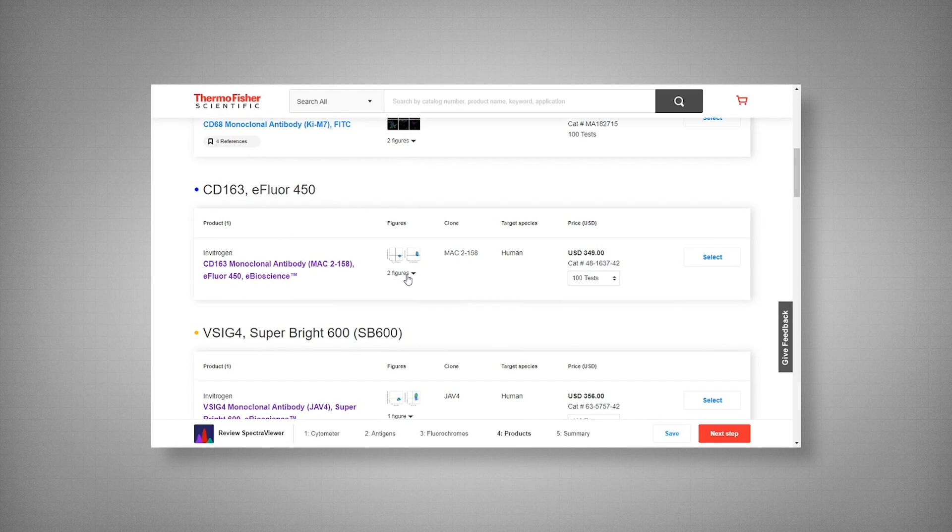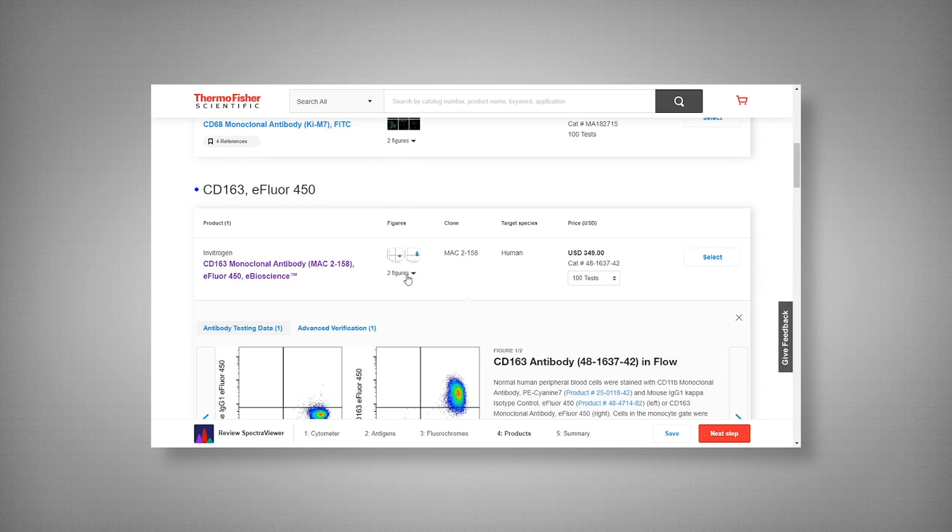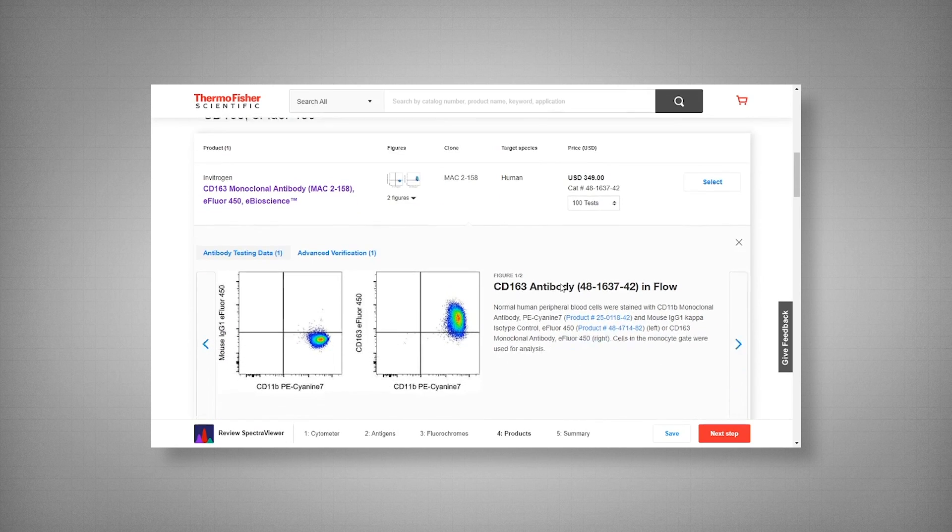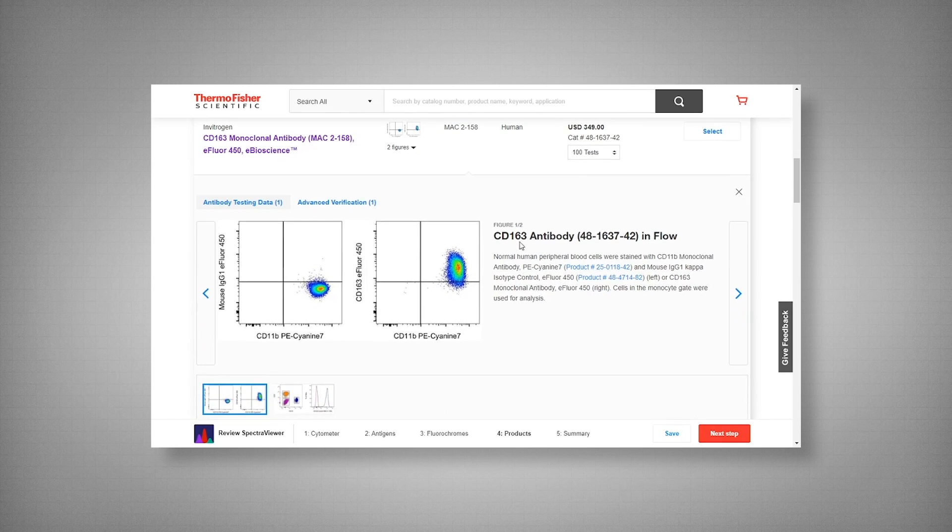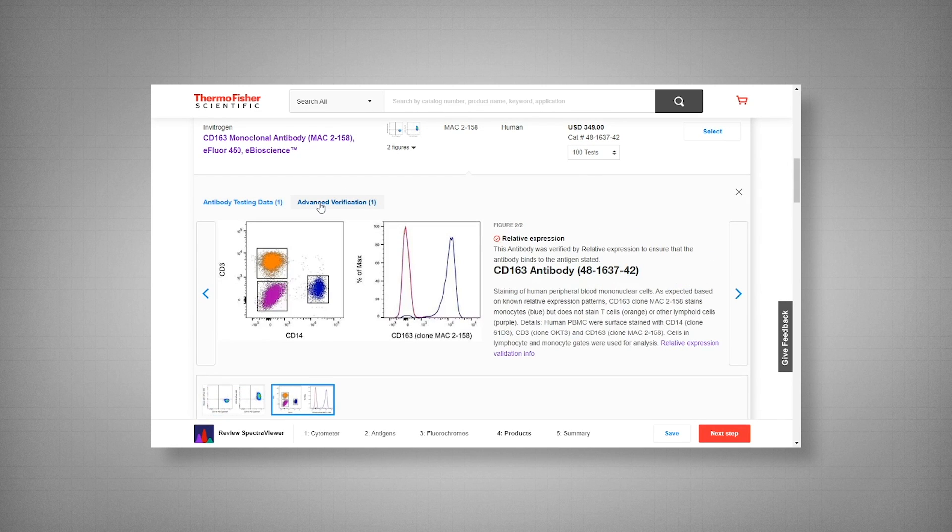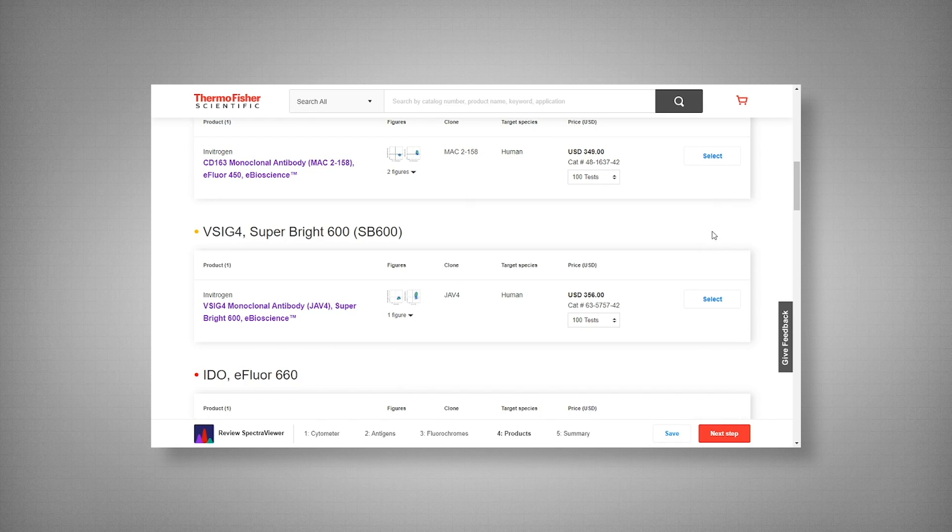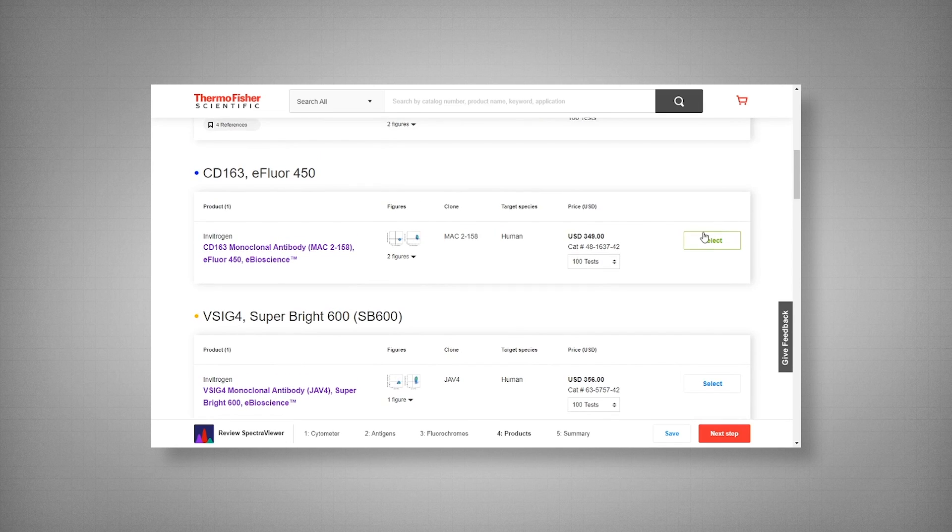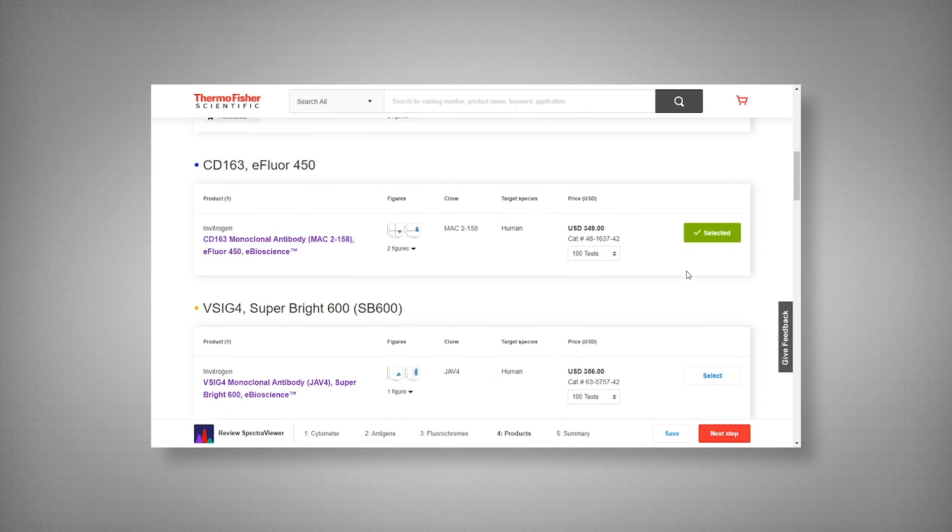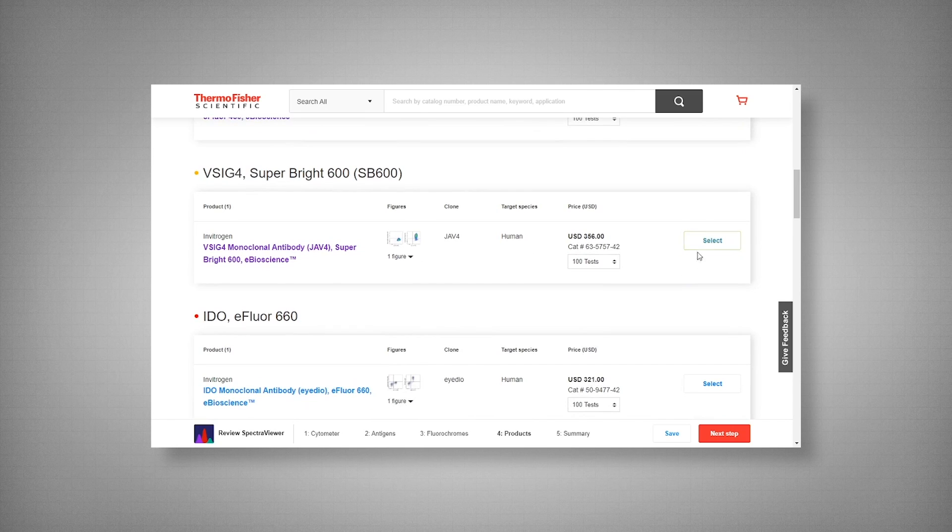And CD163 we have MAC-2-158 available. Now if you click on the figures for this specific clone, you can see that it's undergone advanced verification. Meaning that the antibody was verified by relative expression to ensure that the antibody binds to the antigen stated. Which makes it a much more desirable clone in my opinion.